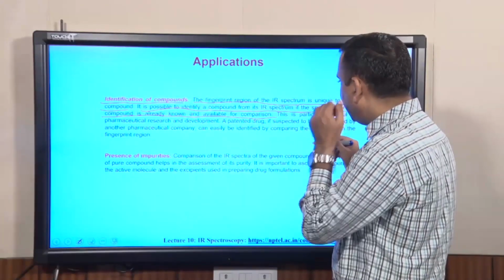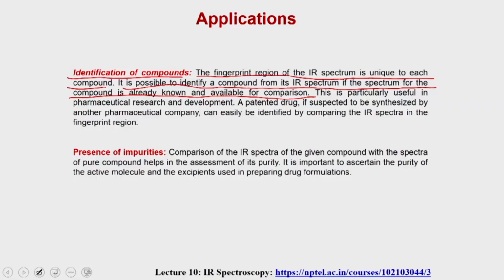So, it is very important that you have a standard IR spectra for comparison if you would like to use IR spectroscopy to identify the compound.